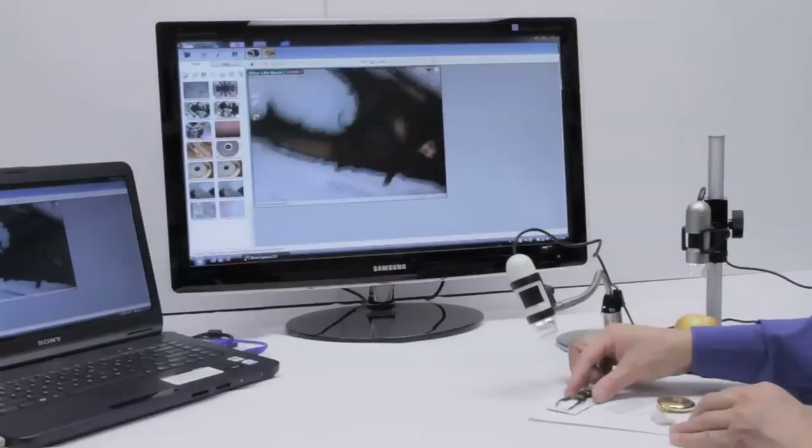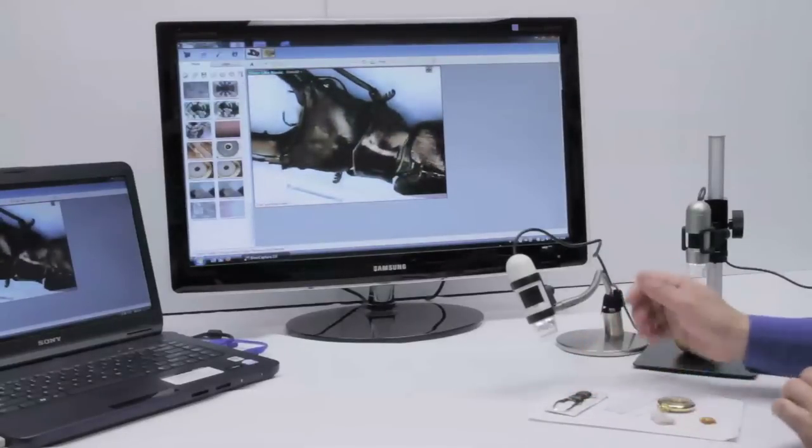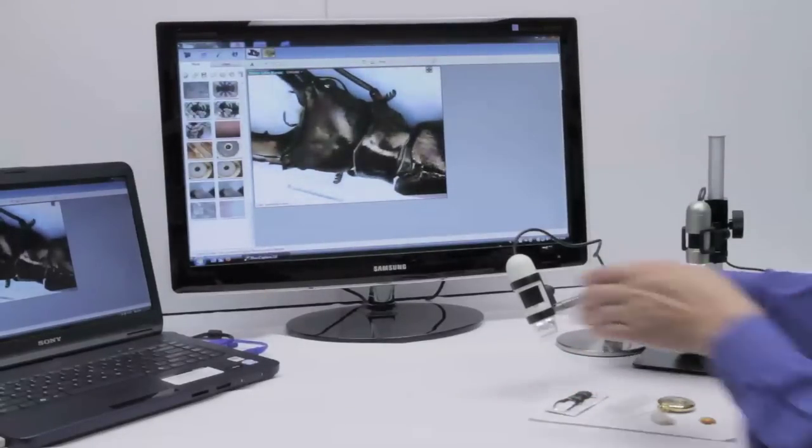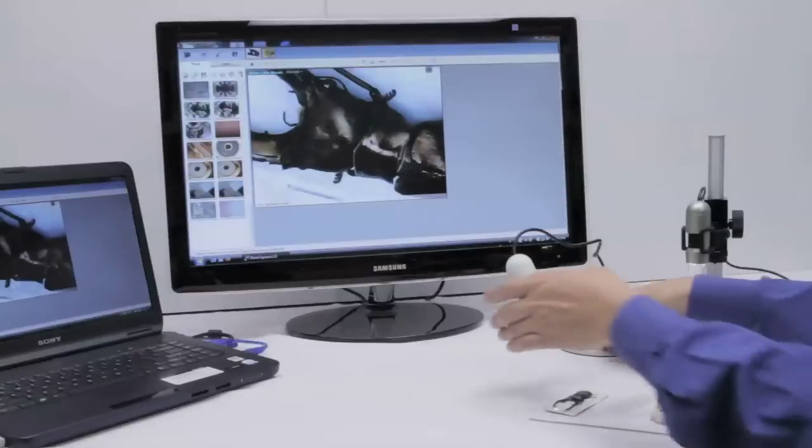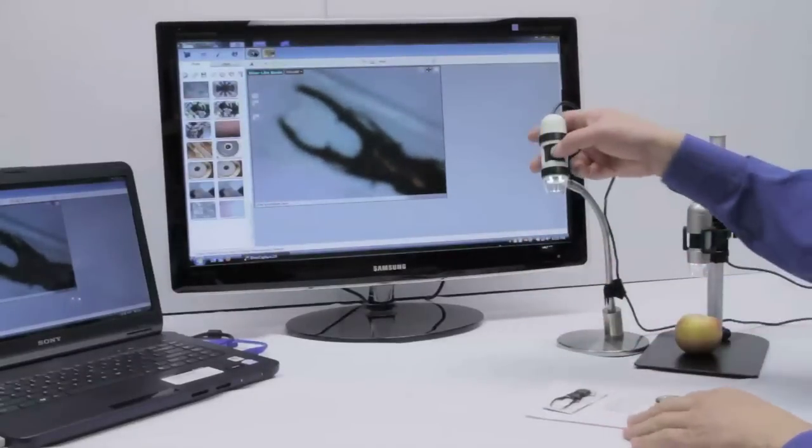In order to lower the magnification and potentially get the whole object in view, you just move the scope away from the object, lowering the magnification.